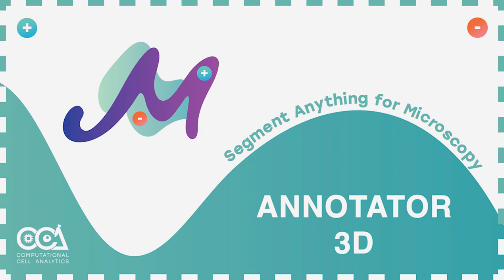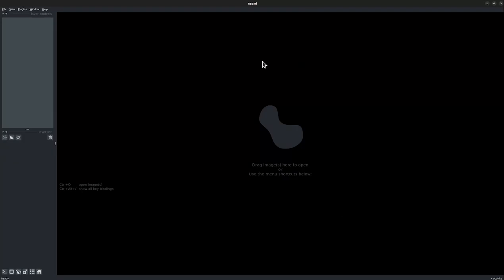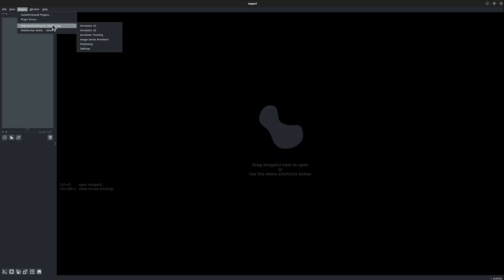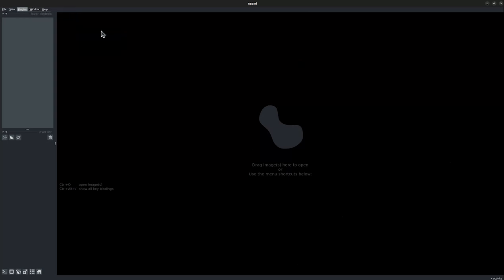Hello everyone, welcome to MicroSAM. In this tutorial video, we'll be learning about how to use the 3D annotator. Let's get started. Let's go to Plugins, Segment Anything for Microscopy, and choose the 3D annotator.